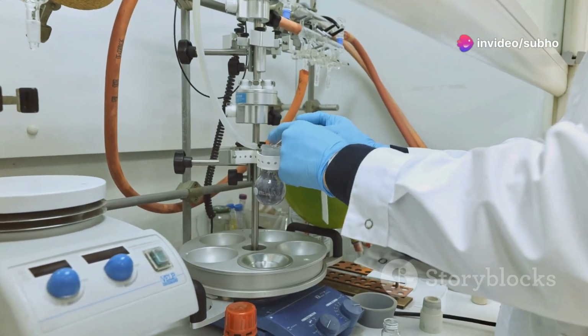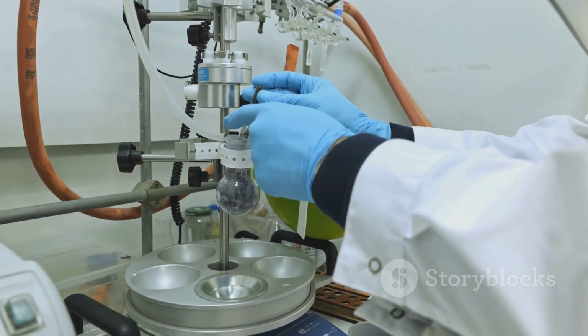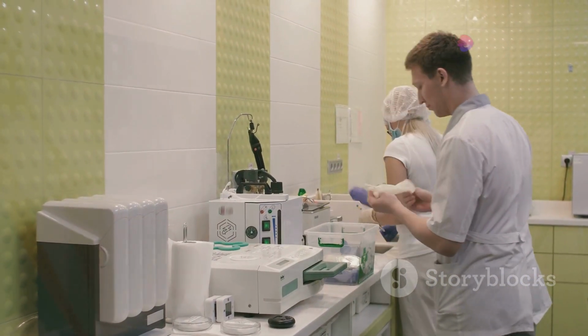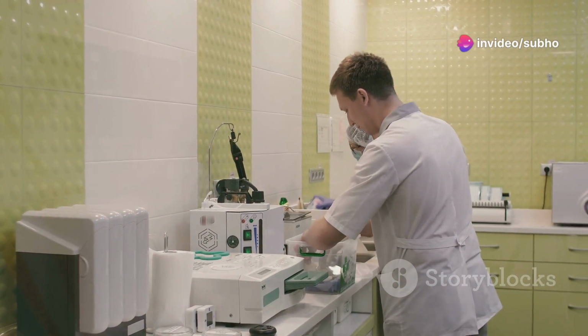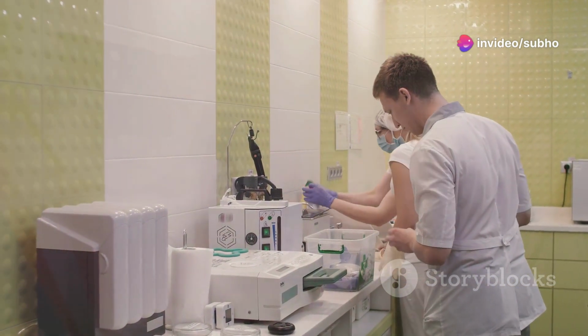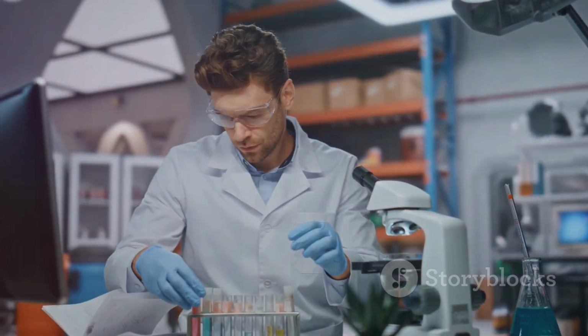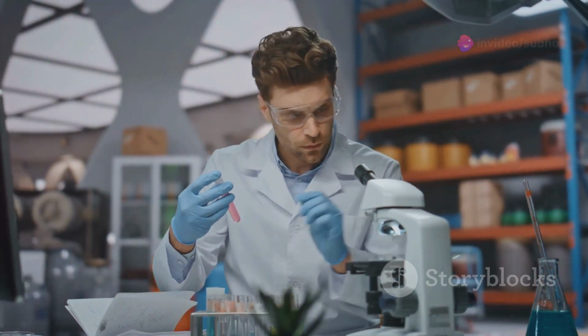One exciting area of development is the miniaturization of Maldi-Tof MS instruments. Imagine handheld devices that can perform rapid analysis in the field, whether it's identifying pathogens at a patient's bedside or detecting contaminants in food products on site. This would revolutionize many industries, making testing faster, more accessible, and less expensive.